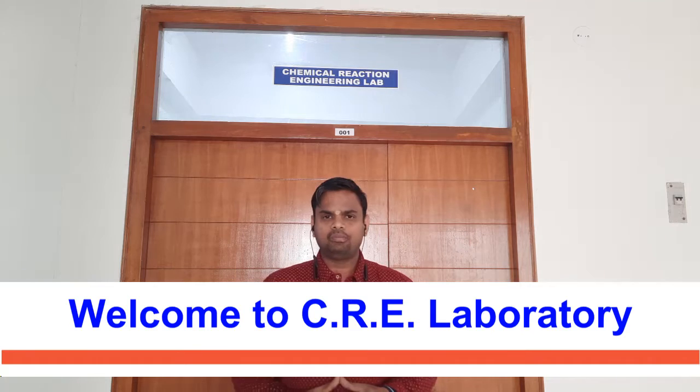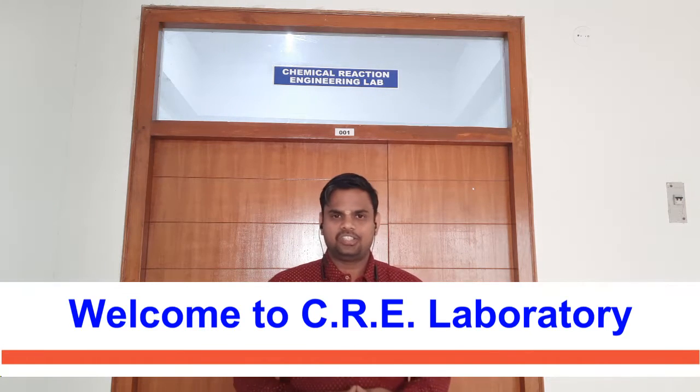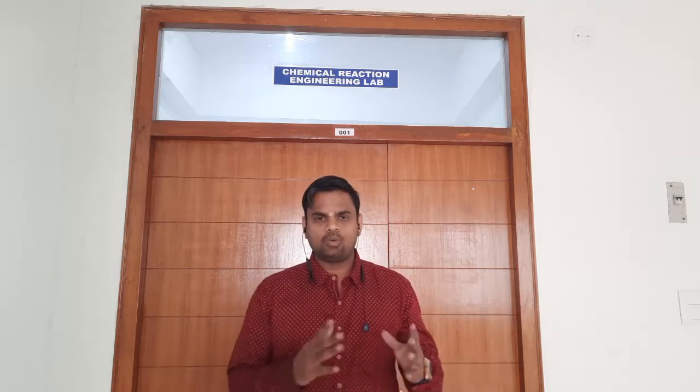Today we are going to perform Cascade CSTR, that is CSTR in series. So we have 3 CSTRs of equal volume. They are in series. So from one CSTR, the product will be sent as the feed to the second CSTR. From the second CSTR, it will be sent to the third CSTR.